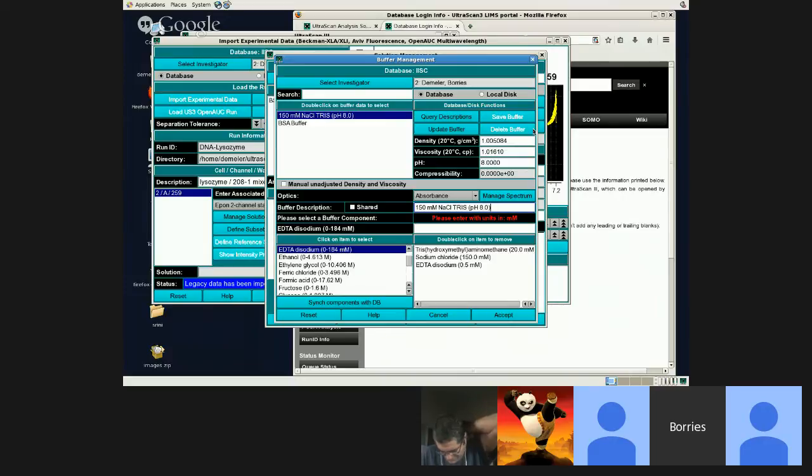Can you show your screen so I can take a look at that? Okay, how do I do it? So if you go over to the left of your screen and you touch the left corner of the screen, then a little bar should come up, and at the top there is a green icon with a white arrow on it, and if you click on that, then there's screen share, and then you can share your screen, and I can take a look at that.